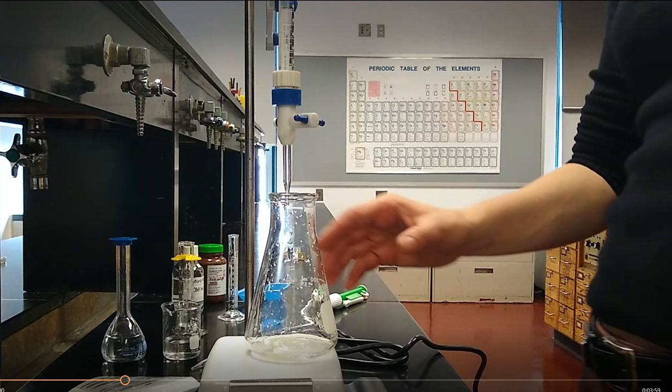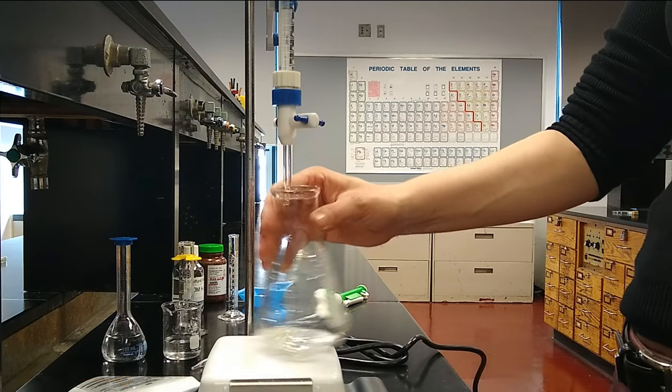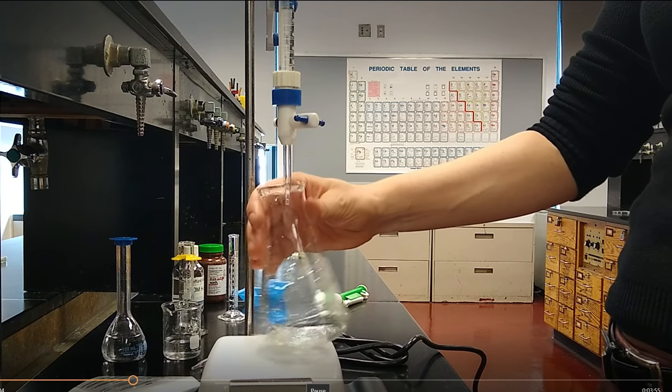Starch is also used. We'll talk a little bit more about that later. That's an indicator, it is not measured carefully. Let that swirl up a little bit to help things dissolve.